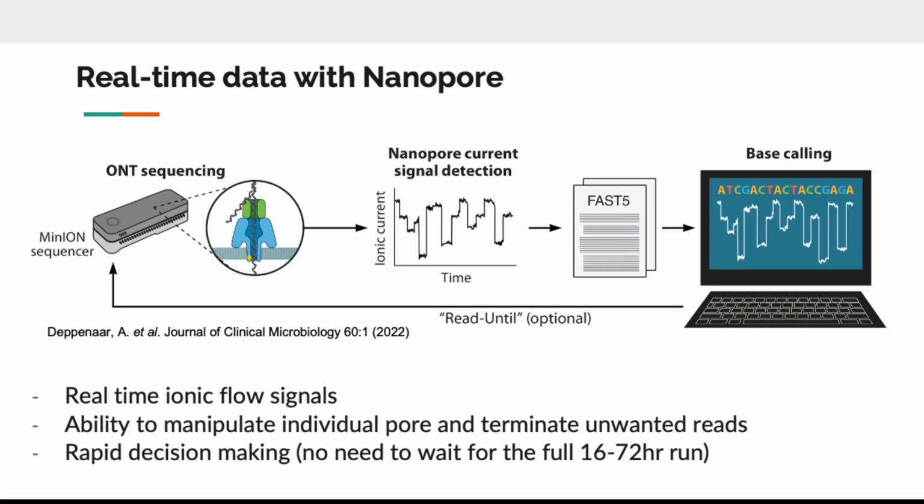And I mentioned earlier that nanopore is very fast. So with Ion Torrent, you get the result in 2 hours, but you get short reads, and you have a problem with homopolymers. With nanopore, including all the sample preparation, you can get the full long read sequencing within a day.